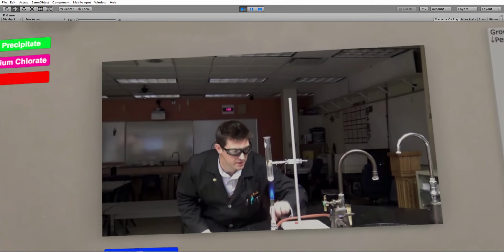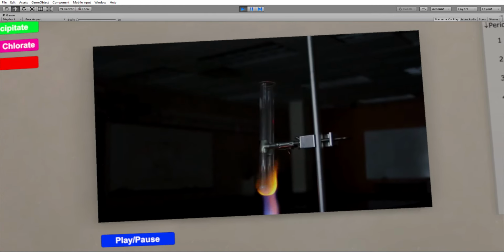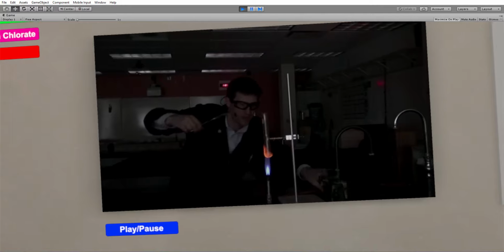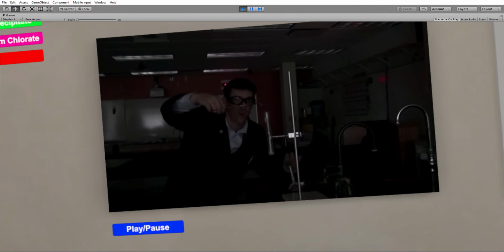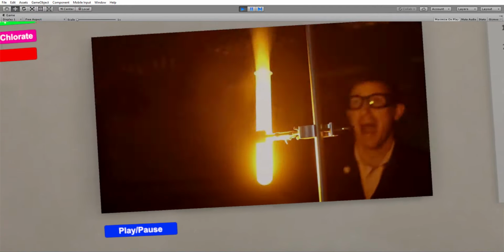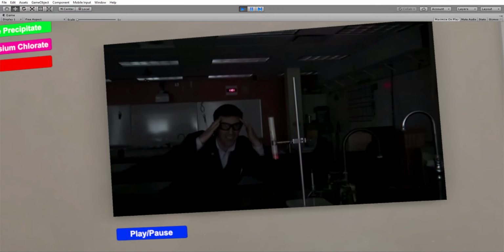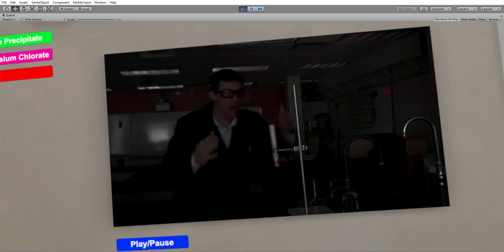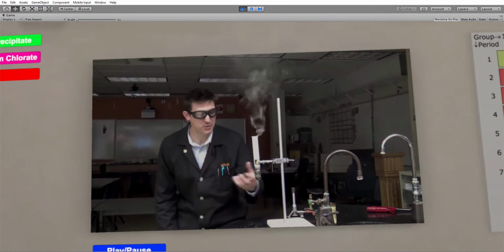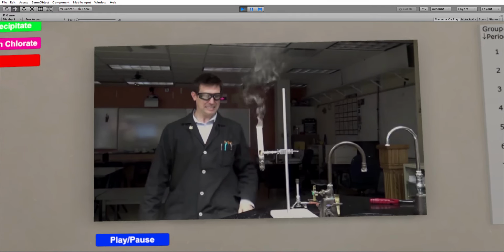So I'm going to heat up something called potassium chlorate. And this is going to break the sugar down, just like what happens inside our body when we eat a gummy bear. It breaks the sugar down and releases the energy. Only this chemical is going to allow it to happen a little more quickly than it happens in your body. What? Oh my gosh. It smells like burnt marshmallows. You see all that energy come off of there? That's calories. Oh man. Yeah.